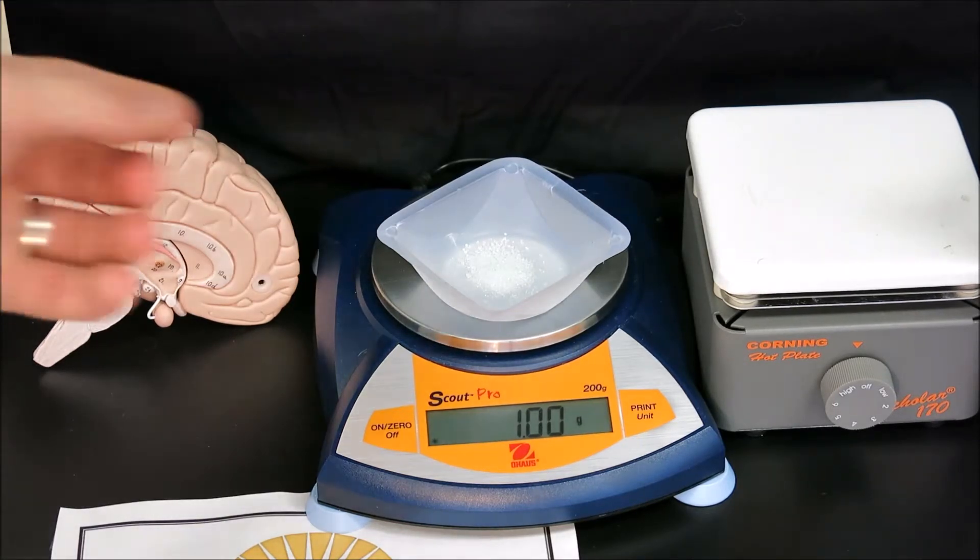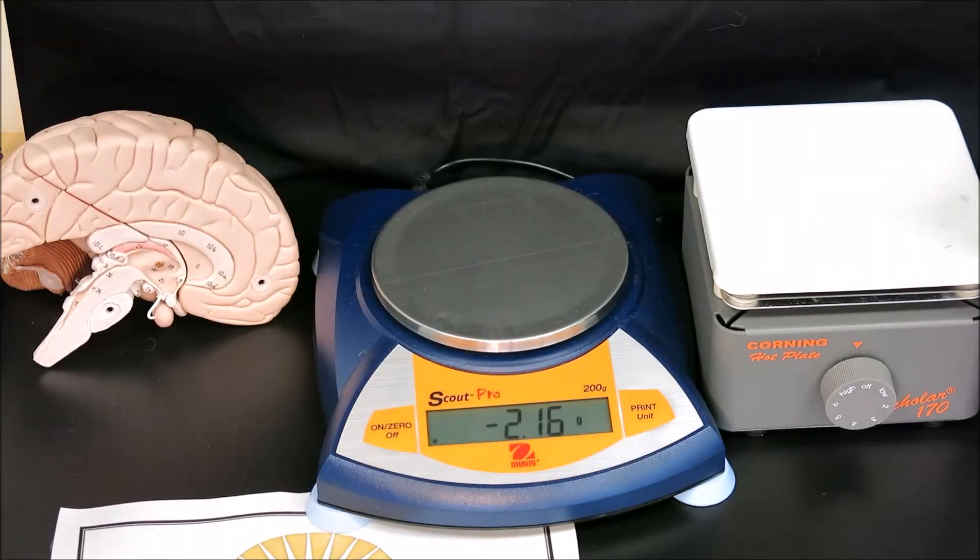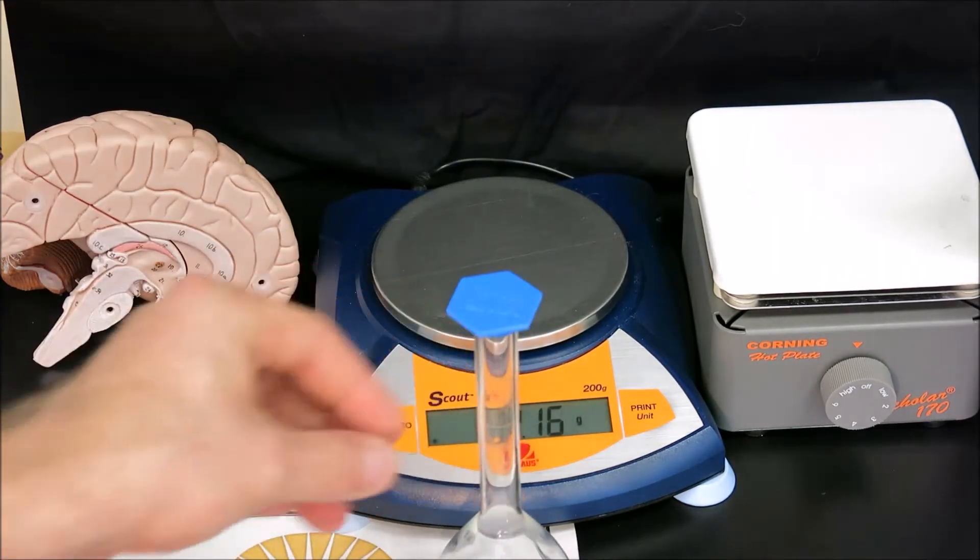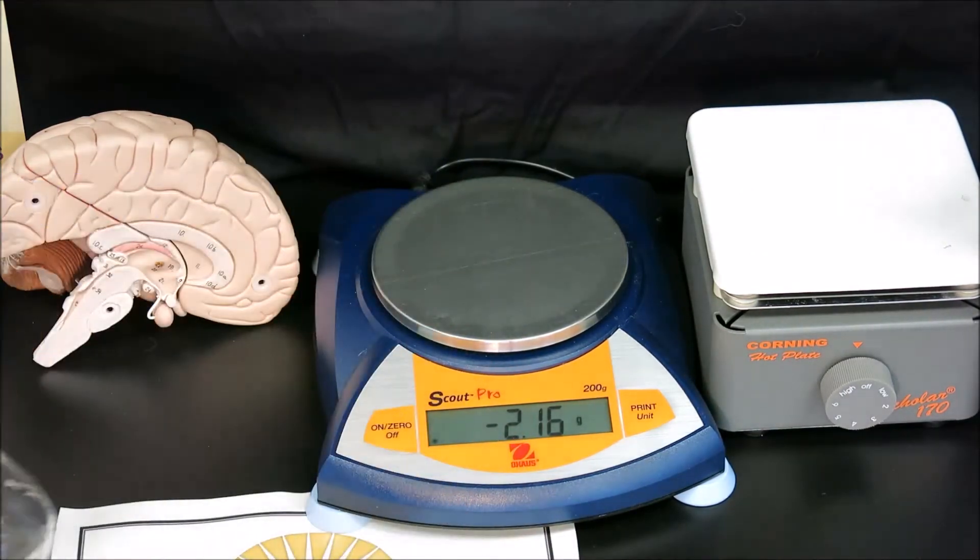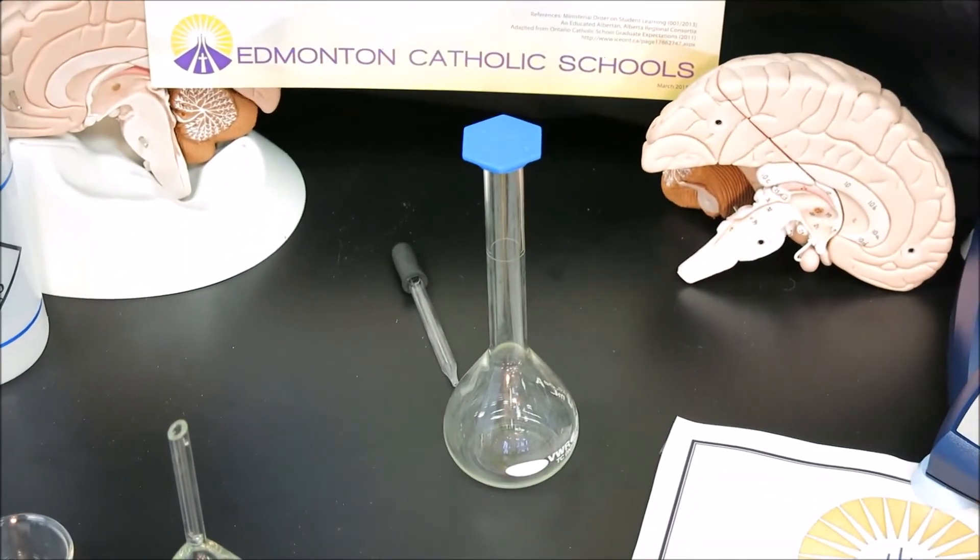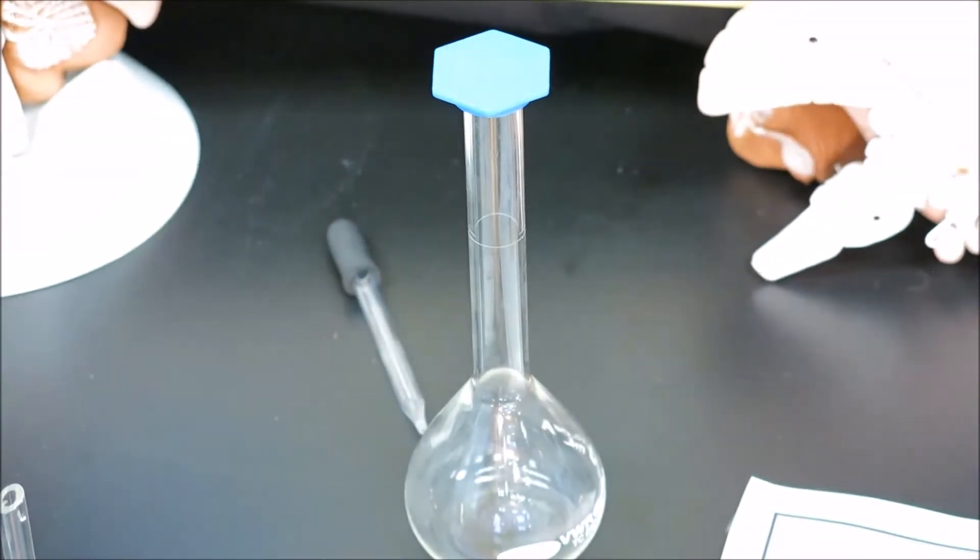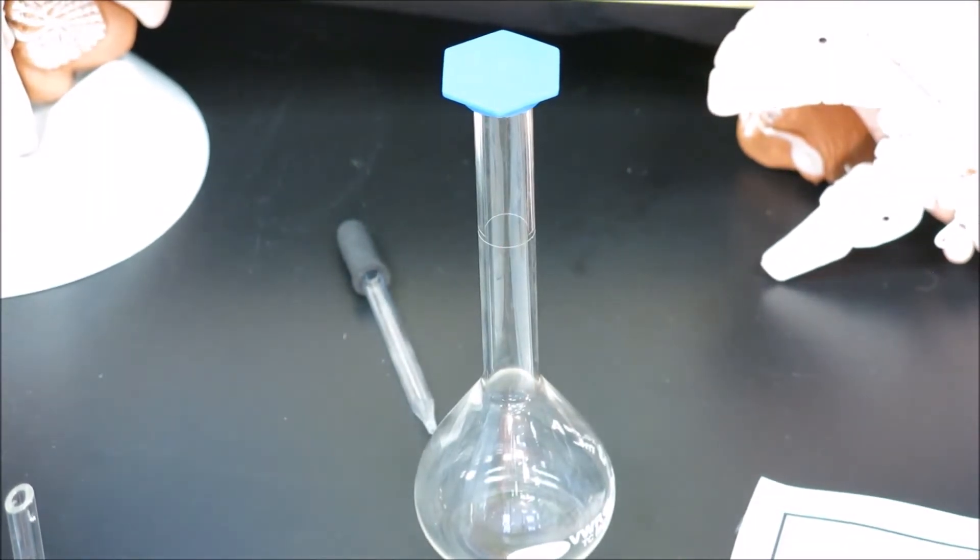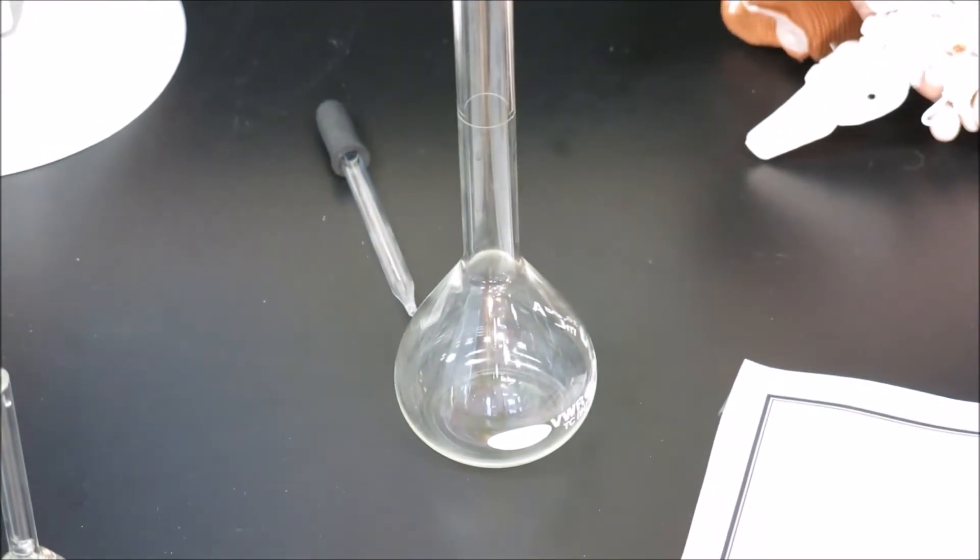In order to prepare the solution, I cannot pour the solid into the neck of the volumetric flask. The flask's neck is far too narrow, and the solid could get stuck inside, not allowing it to dissolve properly. Instead, we will mix the solid into a small beaker and transfer that mixture into the volumetric flask, at which point we will fill up the flask to the volume we need.